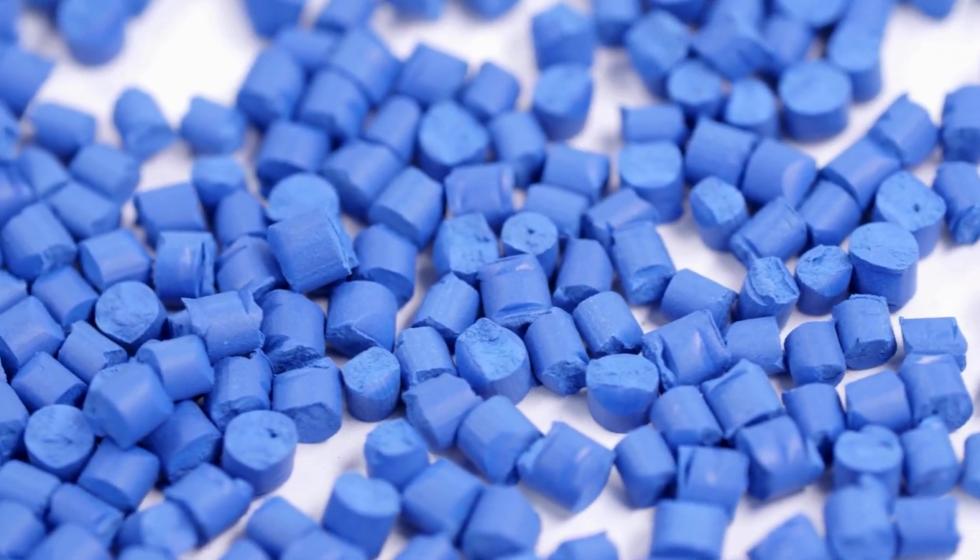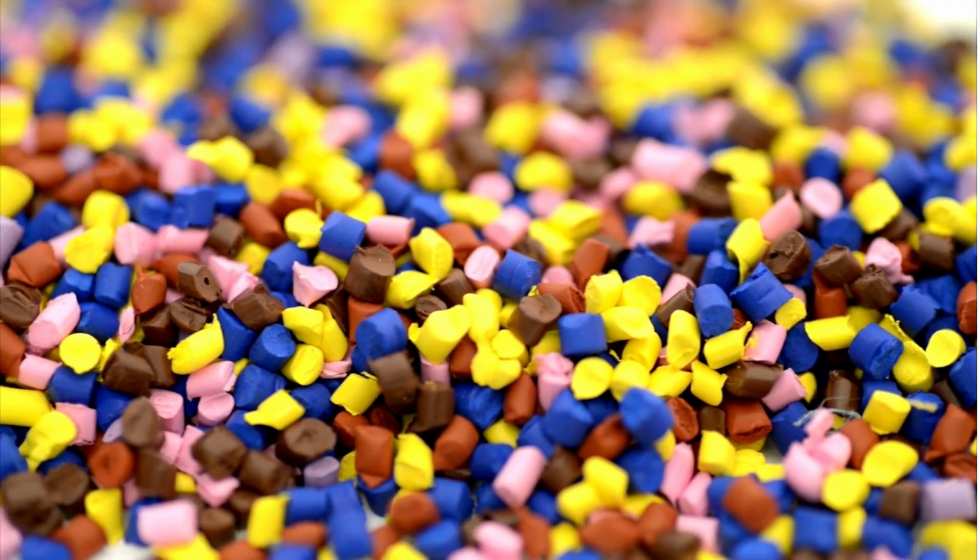Next, polymers have become the most widely used materials in modern microfluidic fabrication because they are accessible, affordable, and highly versatile. Within polymers, PDMS, an elastomer, is especially favored for its flexibility, optical transparency, and compatibility with biological samples. PDMS naturally repels aqueous solutions, making it ideal for experiments involving fluid flow and cell culture. Other polymer options are thermosets like TPE, which offers strong, solvent-resistant, and optically clear structures for microfluidics. But their higher cost and need for surface modification limit their applications.